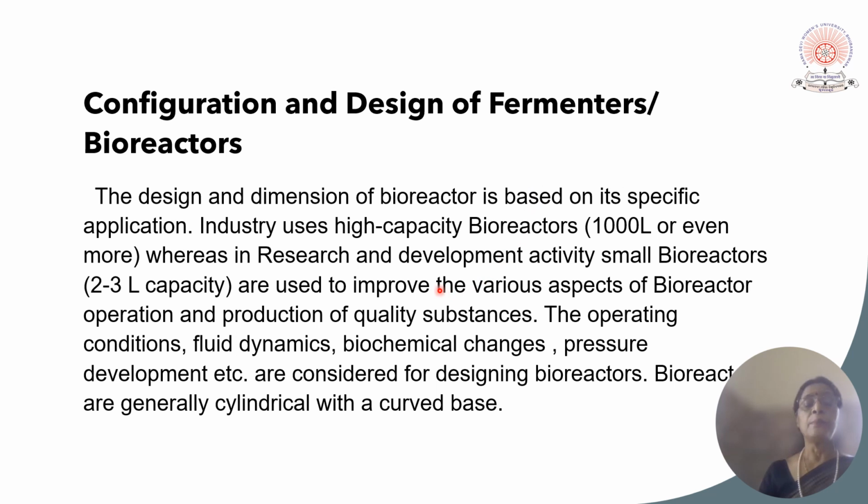Inside a fermenter, many chemical reactions occur and microbial biomass or cell culture is done at optimal conditions. Due to this, the design is very important, and many things are taken into consideration like fluid dynamics, biochemical changes, pressure development, etc.